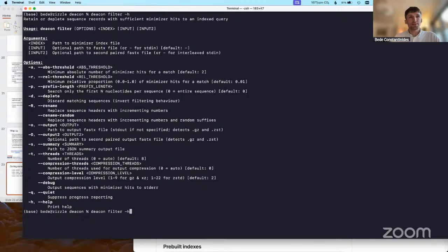I've got it stored in data, and this is the file name of the index by default. Then you provide a path to your sequences. These could be FASTA or FASTQ. The quality isn't used directly, that's something to know. They could be assembly contigs or raw reads.